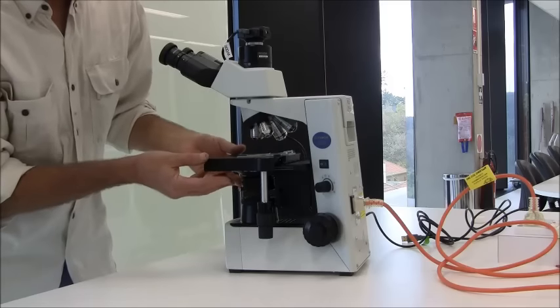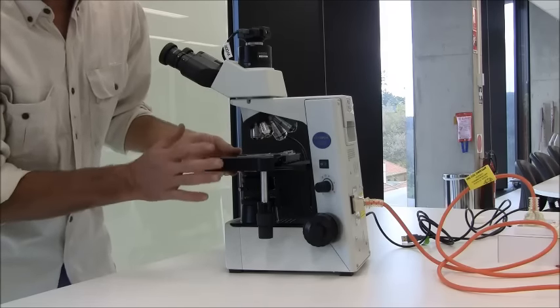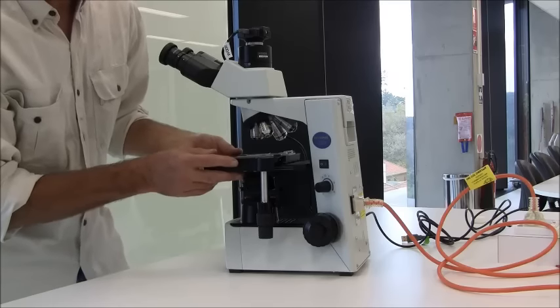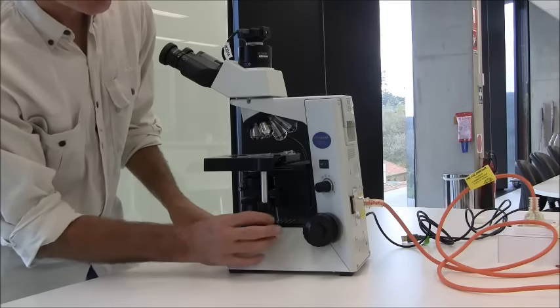You can move the stage by holding the stage, and we don't want you to do this. It's kind of driving it in the wrong way. We just want you to adjust the stage using these controls.